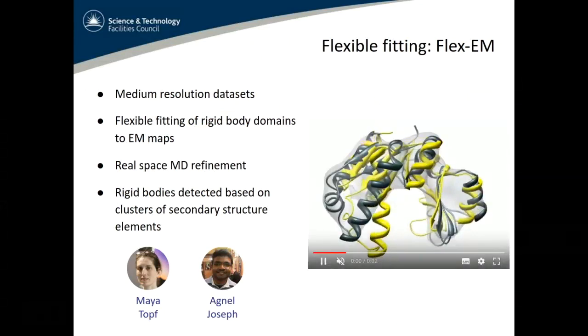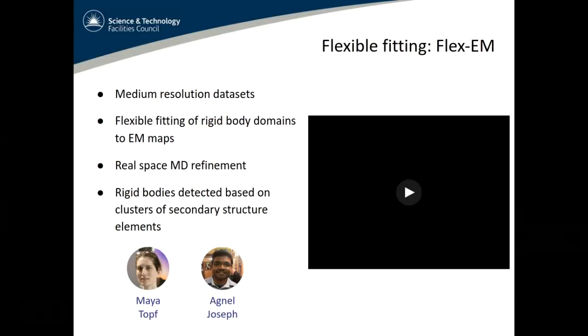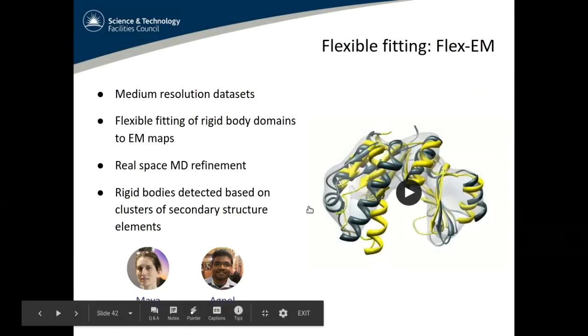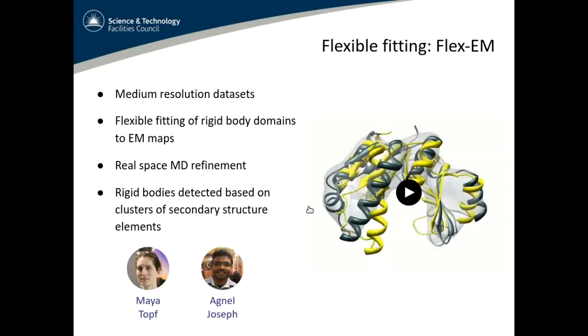So I mentioned how we use Refmac at higher resolutions for medium resolution datasets for flexible fitting. We have a tool called FlexEM, and this is a real space molecular dynamics based refinement. So this is now using a molecular dynamics simulation and constraining it with the map, so it tries to improve the fit.